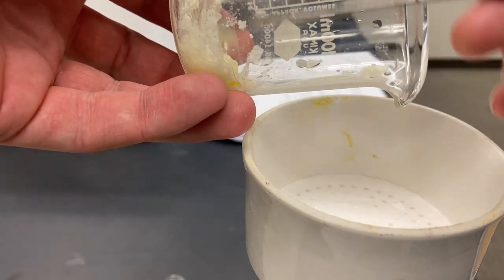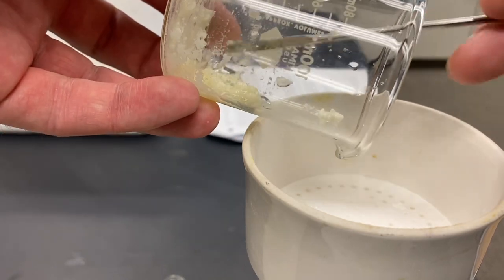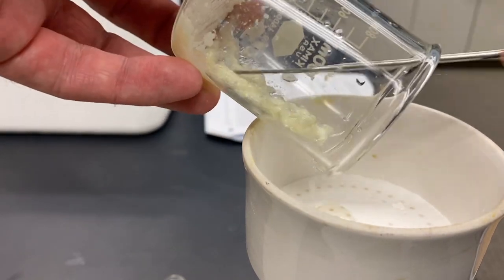It's perfectly fine to let the stir bar go into the Buchner funnel as well. I don't have to worry too much about that. I'll separate it out later.